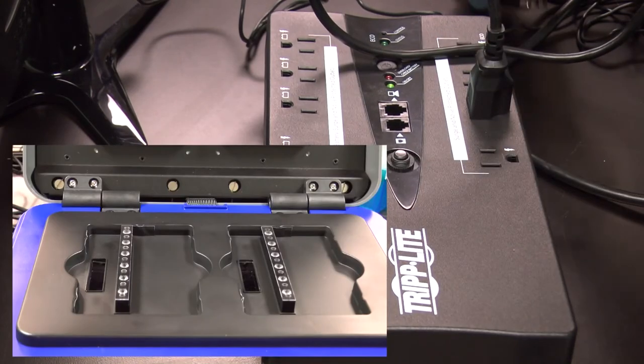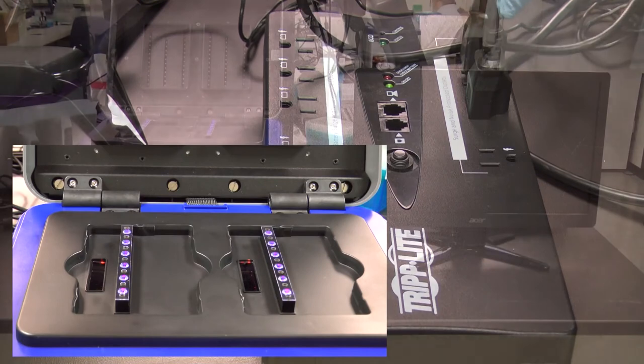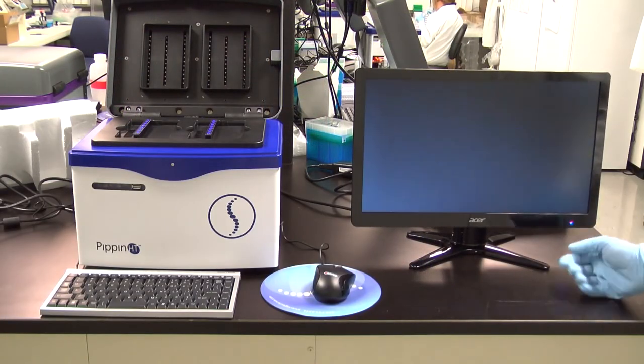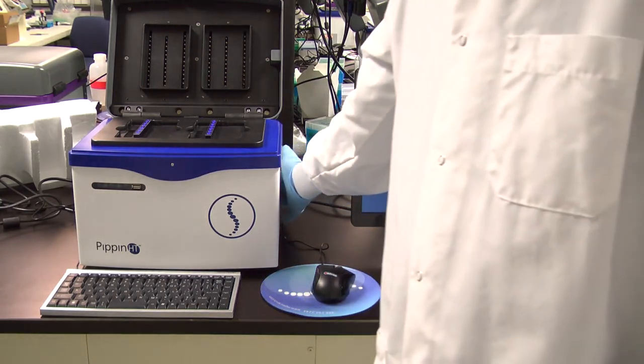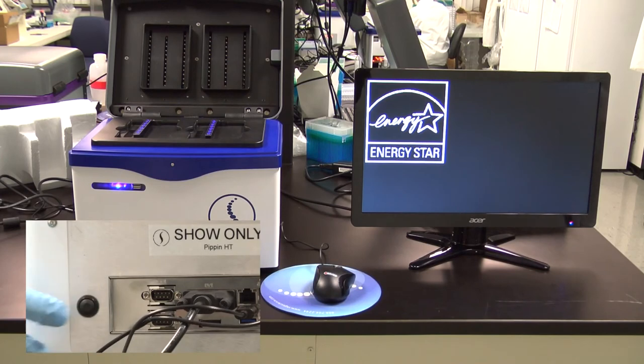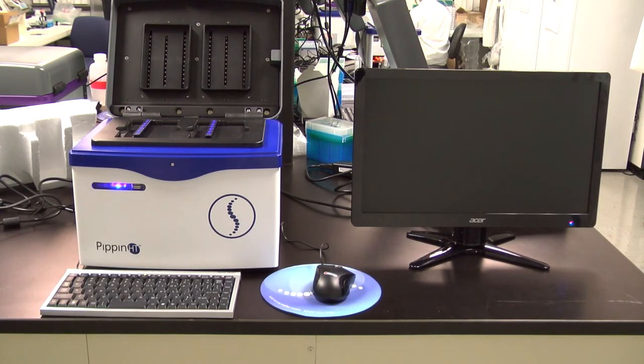The optical LED on the instrument nests will light. To set the correct monitor resolution, turn on the monitor first and then launch the software by pressing the power switch on the back panel of the Pippin HT. The software will take about 30 seconds to open, and a blue light in the front of the instrument will appear.